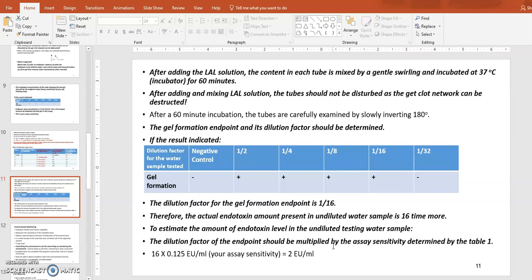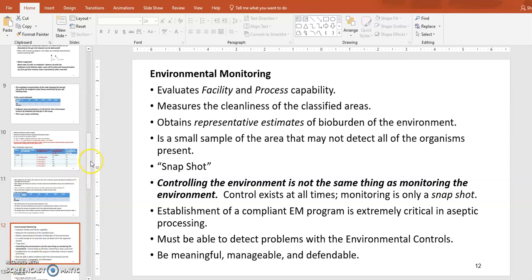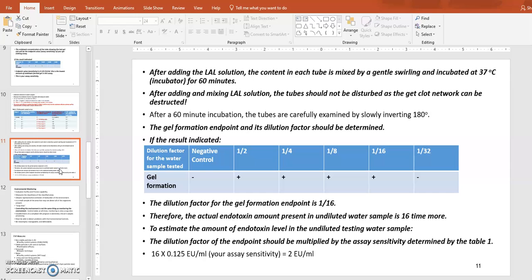Okay, so hopefully you can set up 2 sets of tester tubes with your partner and then test the sample water. It could be whatever water you want to test. Maybe dirty sink water or nanopure water in the lab or tap water. You can determine the amount of endotoxin there. Maybe if you want to test your spit, you're welcome to if you like. All right. Okay, so that's the first assay, endotoxin quantification using LAL assay.